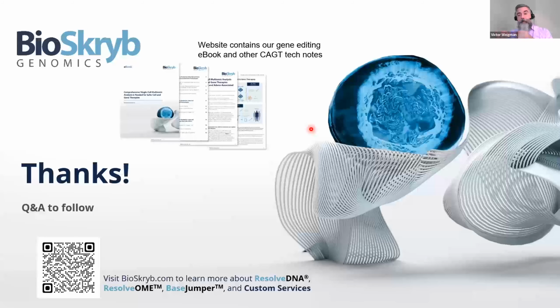So you would be able to leverage the multiple cells per tissue to independently control or confirm the mechanism of action you're predicting. Bulk, which is suitable for most things, gives averages, but it doesn't necessarily confirm that those things are happening within the same population of cells. What we're showing here is that you can confirm that by doing it in the individual cells first, or as a complement to that original bulk approach. So that explains why the single cell approach is important or maybe essential.